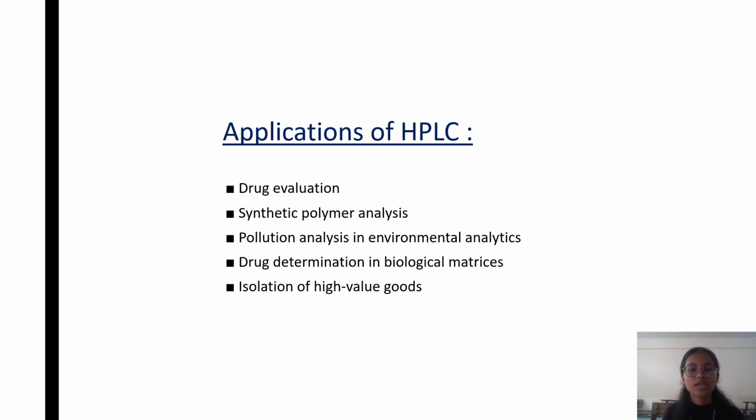So moving on to the applications of HPLC. We use HPLC in various fields, like drug evaluation, synthetic polymer analysis, pollution analysis in environmental analytics, drug determination in biological matrices, and isolation of high value goods.